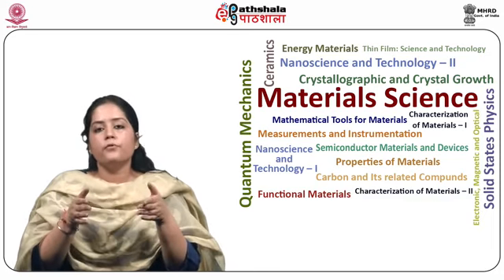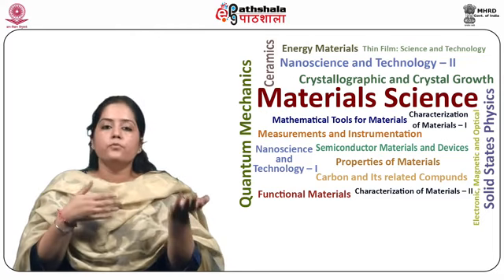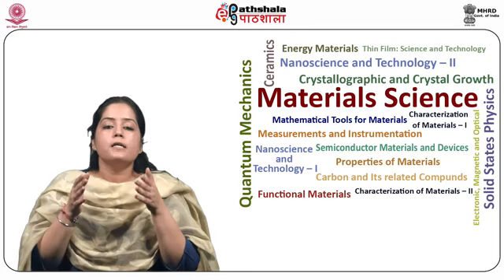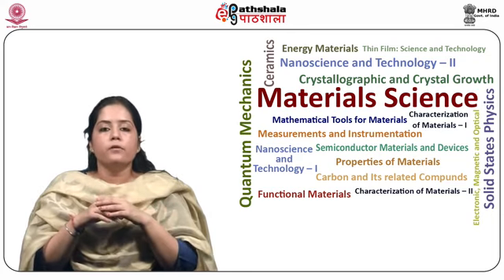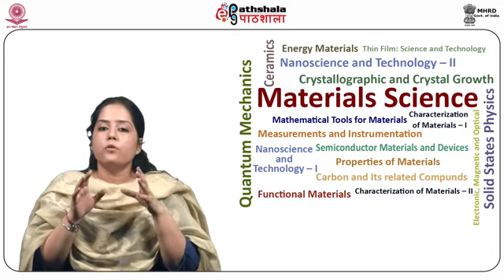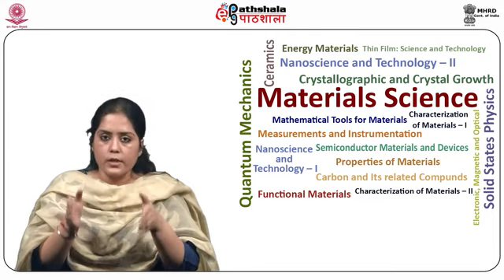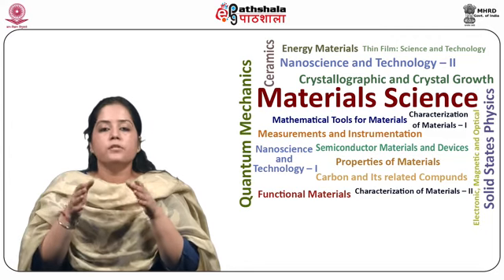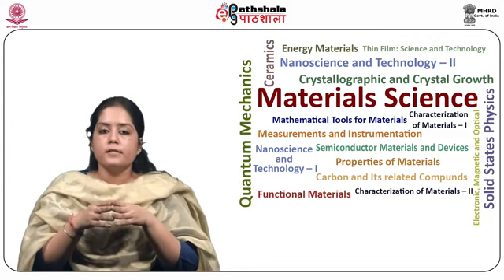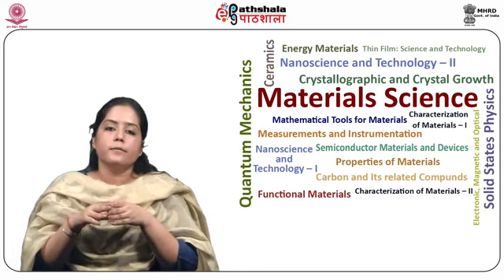The number of photodiodes can vary from 64 to 4096 sensor elements on a chip. However, 1024 photodiodes is the most common. For each diode, there is also a storage capacitor and a switch. The individual diode capacitor circuits can be sequentially scanned.